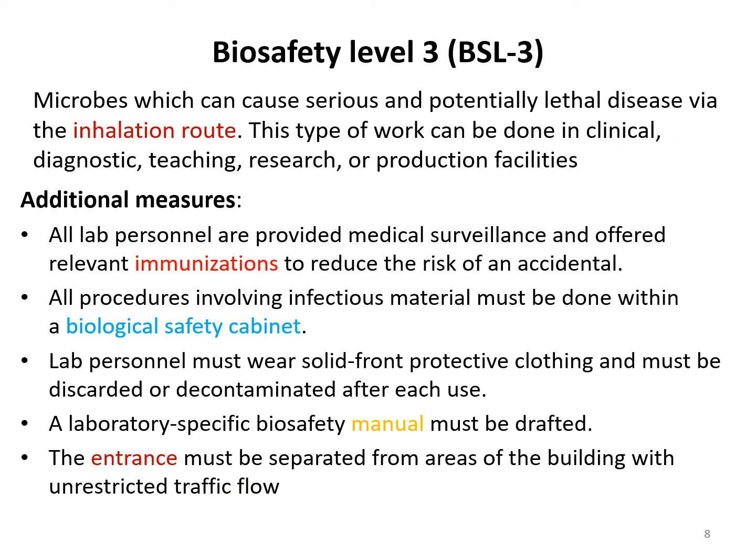Let's talk about BSL-3, the microbes which can cause serious and potentially lethal disease via the inhalation route. This type of work can be done in clinical, diagnostic, teaching, research, or production facilities.